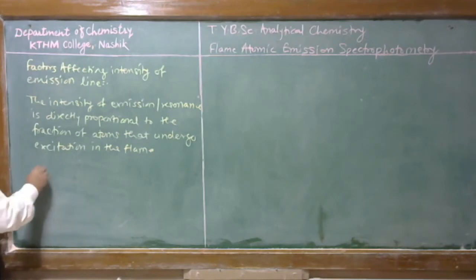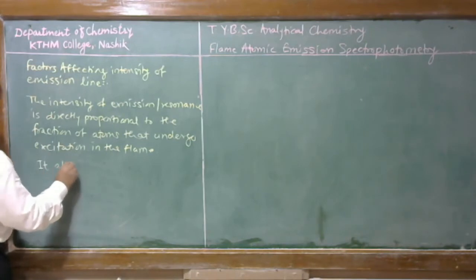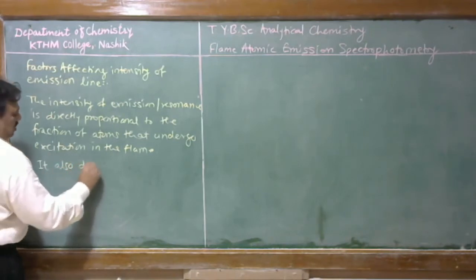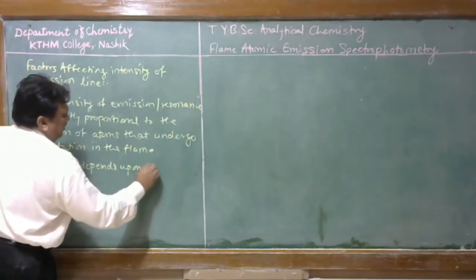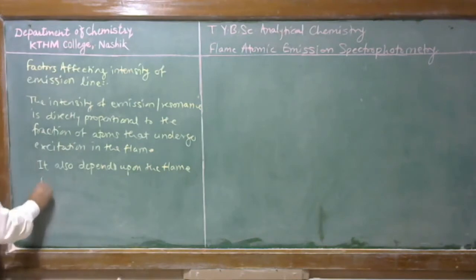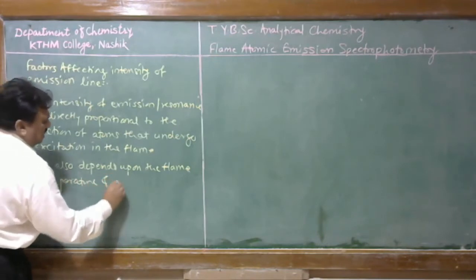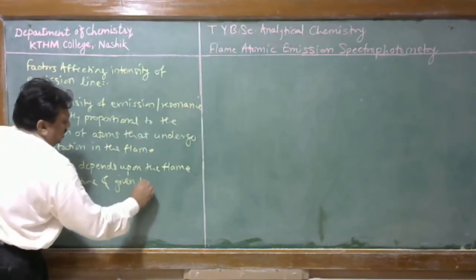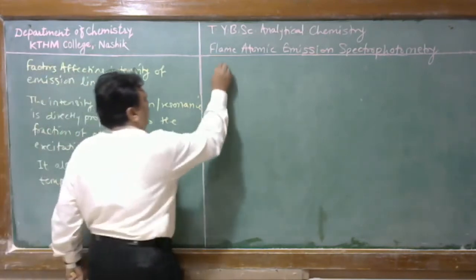The excitation, or the number of atoms present in the excited state, also depends upon the flame temperature and is given by Boltzmann's equation.